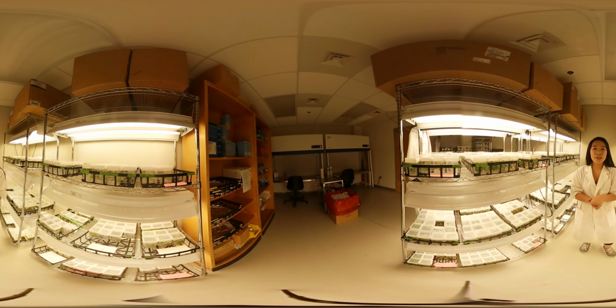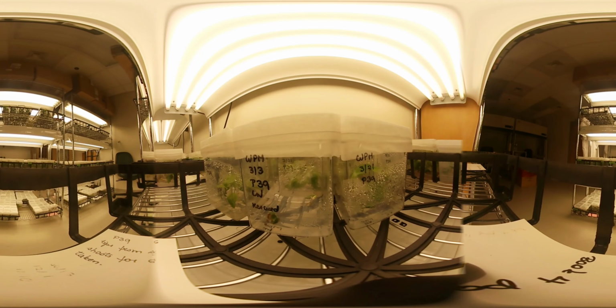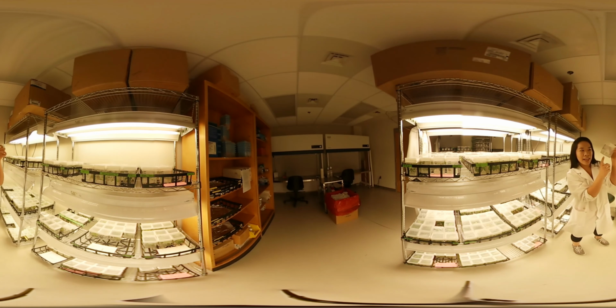So there is a potential solution for that. We can use some non-food resource to produce ethanol, like trees and grass. In my lab, we're using poplar to produce ethanol. As you can see here, they're quite tiny. There are several poplar trees in one cube, and they're very tiny.